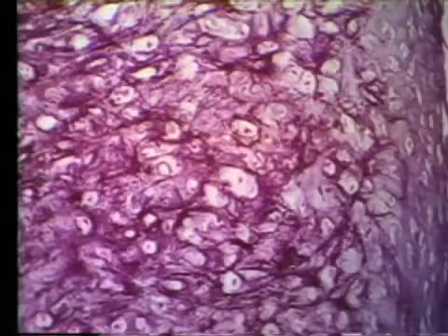Let's see how well you did. We'll review the answers to both the pre and the post test. This is perichondrium. It's responsible for the appositional growth of cartilage. It surrounds the outer surface of cartilage. This is fibrous cartilage. Isogenous groups is the answer. This is elastic cartilage and hyaline cartilage.